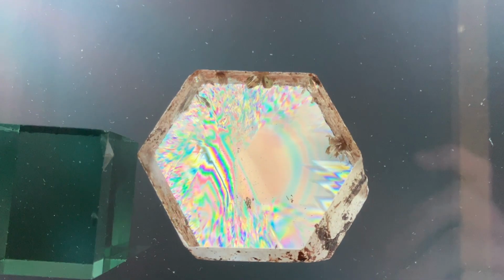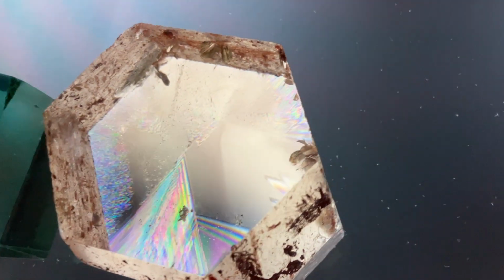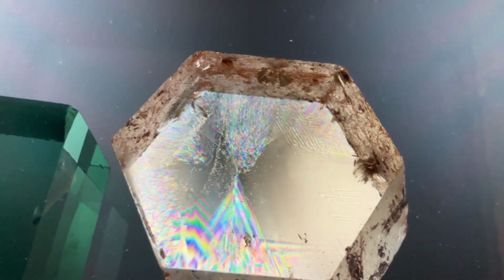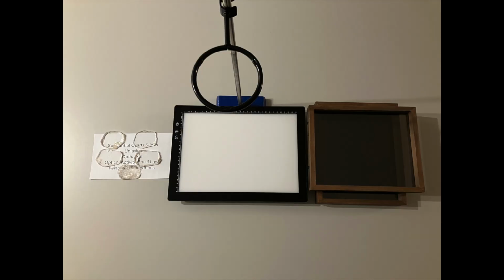The Brazil law twins in our quartz crystal are three-dimensional in nature. And so a way to better understand this is to actually change our viewing angle a bit of our quartz crystal, and you can really get an idea of how these Brazil law twins work. Also, with how thick this particular quartz crystal is, it makes viewing some of the Brazil law twins a bit more difficult since they're really stacked on top of one another. So another way to investigate this is actually to take sequential slices from a quartz crystal and investigate those in our polariscope. So that's what we're doing with the next piece of our experiment here.